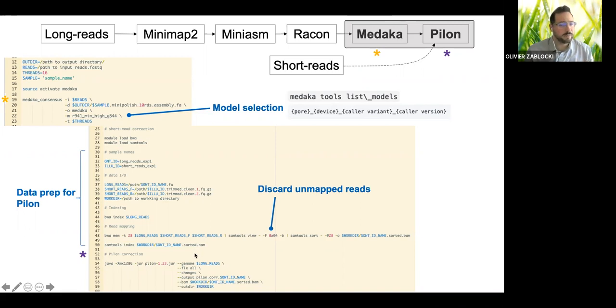The genome it expects, it's called a genome like that because Pilon was originally developed for one of its uses. It was developed for the Human Genome Project in order to resolve variants, I believe, during that sequencing effort. So it basically expects a genome, but it will accept pieces. It can accept thousands of different contigs. And so this would obviously be the long reads.